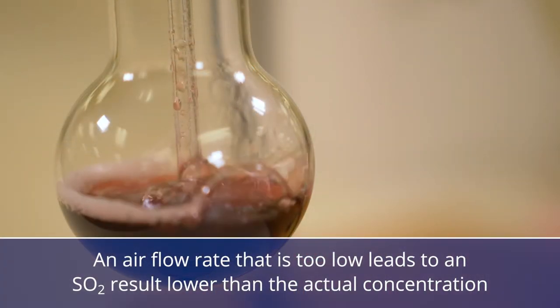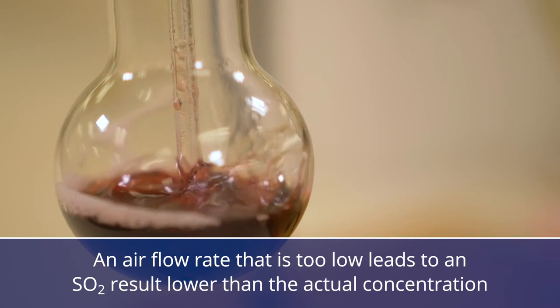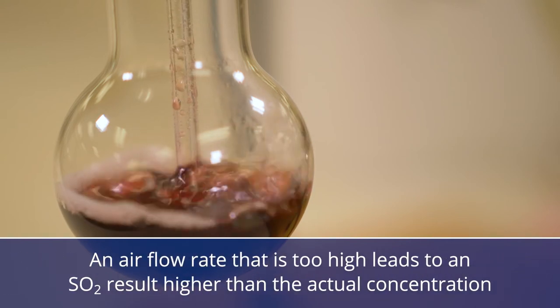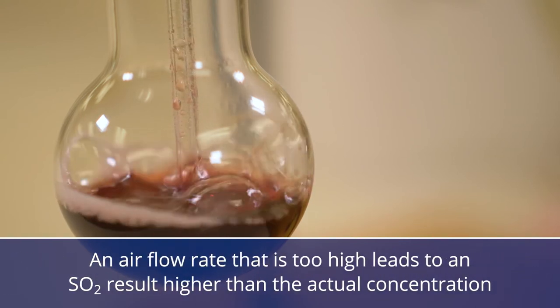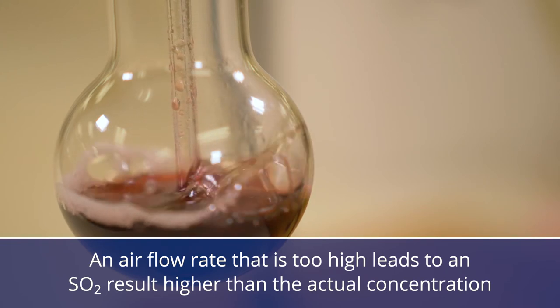If the flow rate is too low, not all the sulfur dioxide will be removed from the sample, giving a result lower than the actual concentration. If the flow rate is too high, droplets and other contaminants can be carried through to the hydrogen peroxide solution, giving a result that is too high.